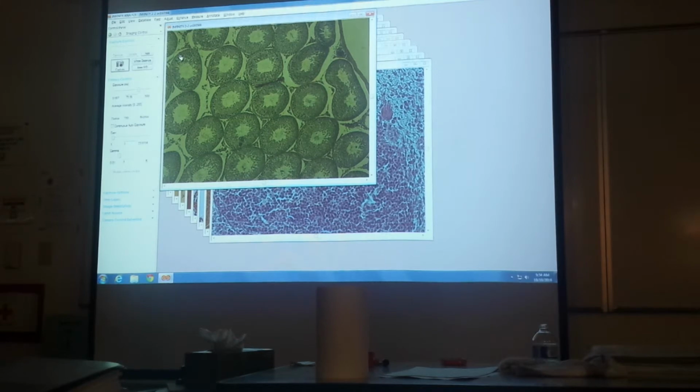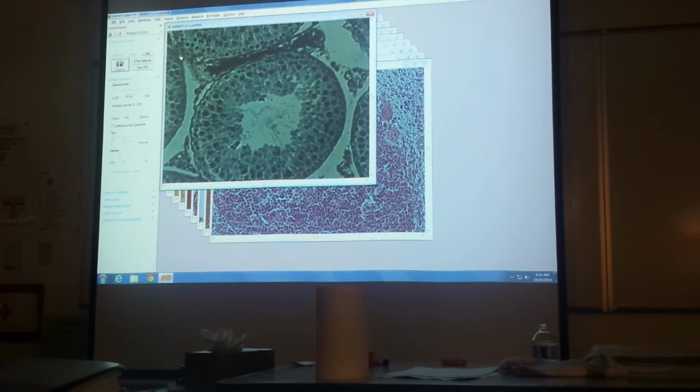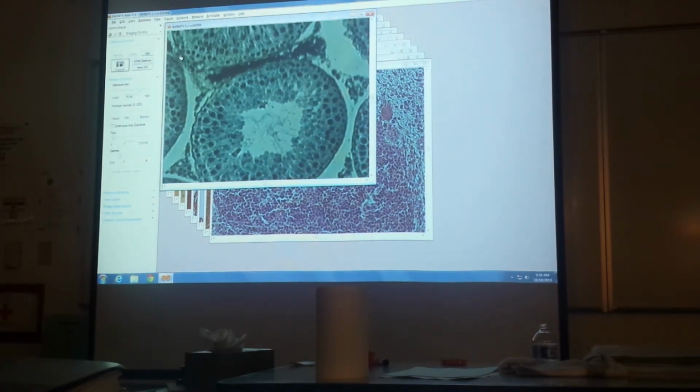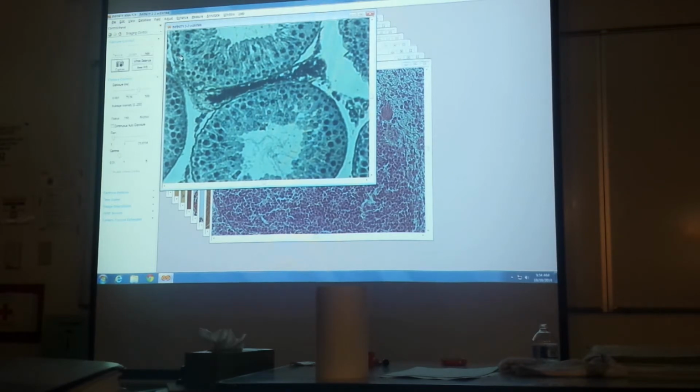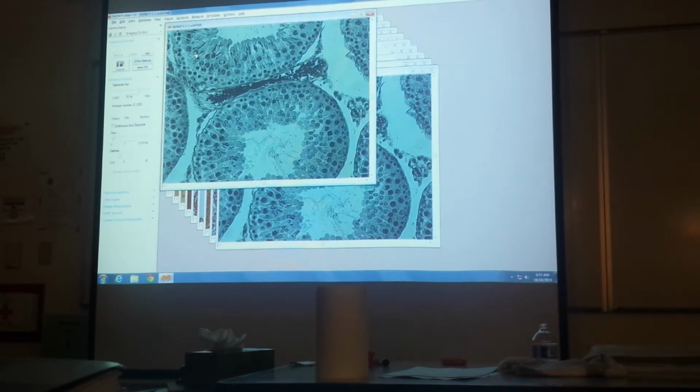Right there, I'm going to look at that. Let me see what that looks like. That's pretty good. I look at this blood vessel, I only see a TI, one letter, tunica intima. And those are the red blood cells squashed in there. I'll take a picture of that. Find another one.